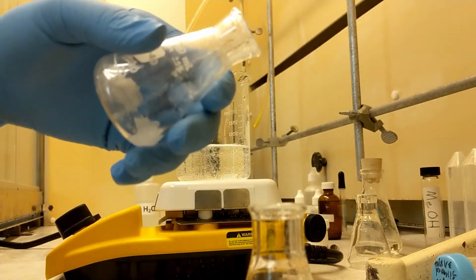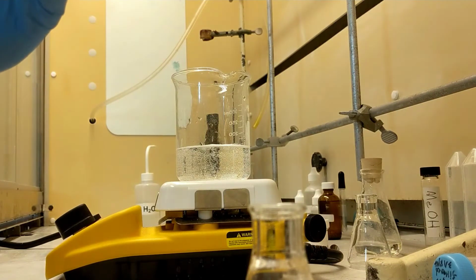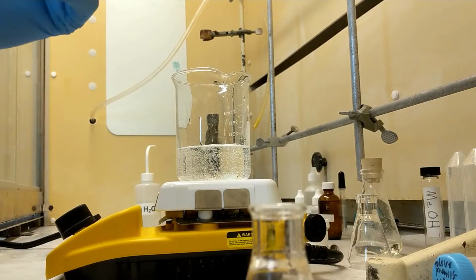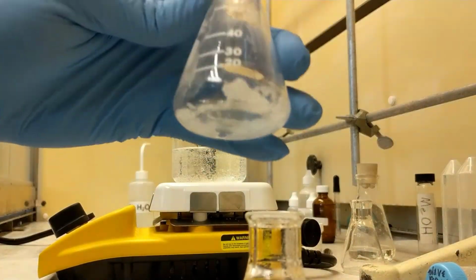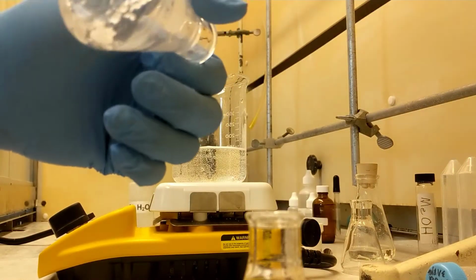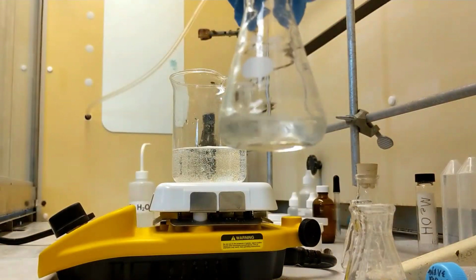If I did grab any drying agent, it would mess up my... Ooh, that was bad. My percent yield calculations. That's why I'm trying to be very careful. There we go. As you can see, just drying agent left there at the bottom. I don't see any liquid, so here's my dry methylene chloride.